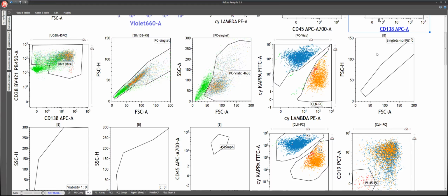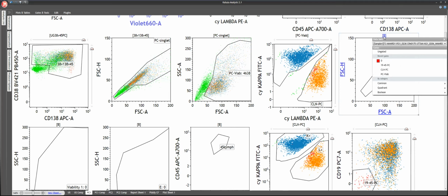So you also see there are some empty gates. What are these empty gates? These empty gates are to identify other parameters or other populations which represent hemodilution or bone marrow representation. So what we want to look at are the mast cells and hematogones. So for that, what we have done.